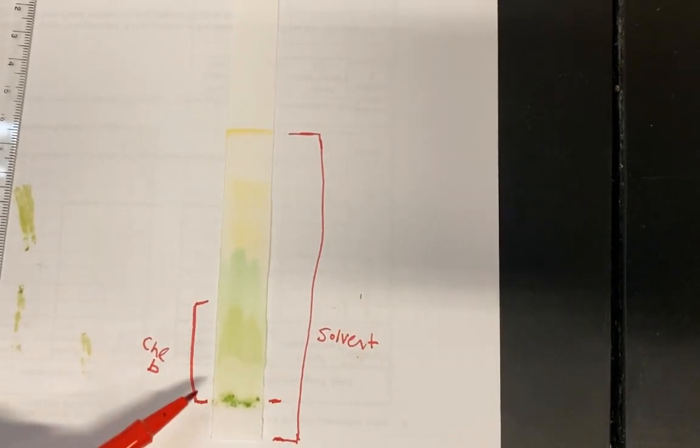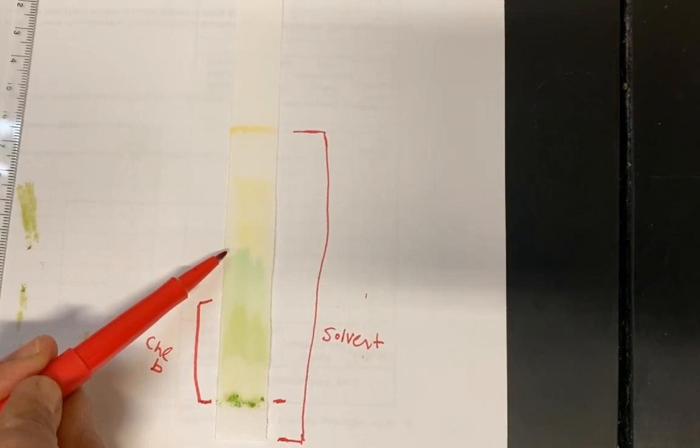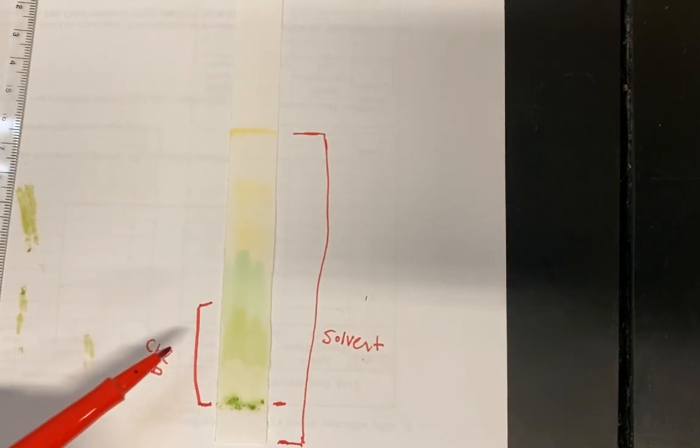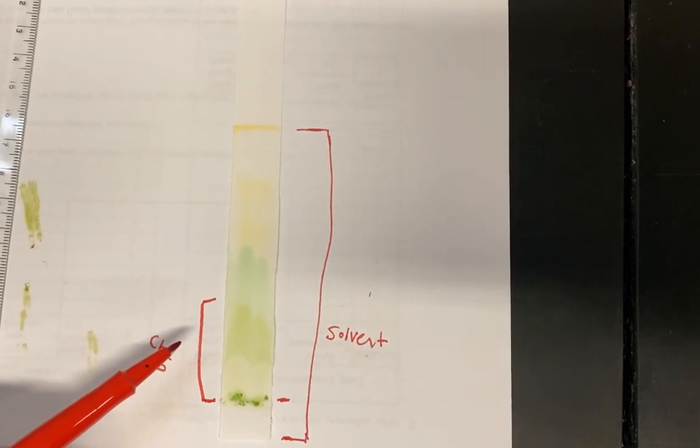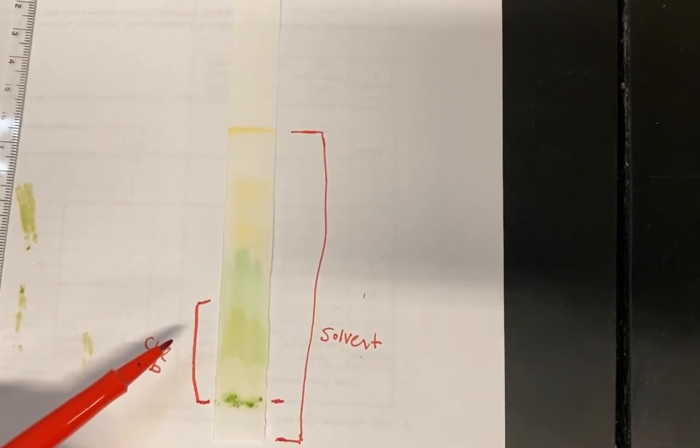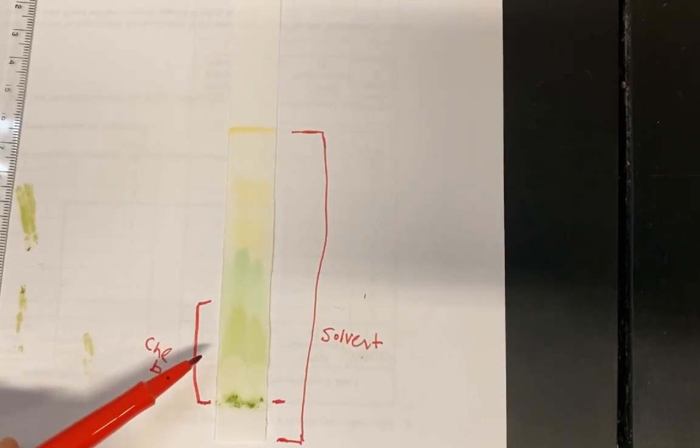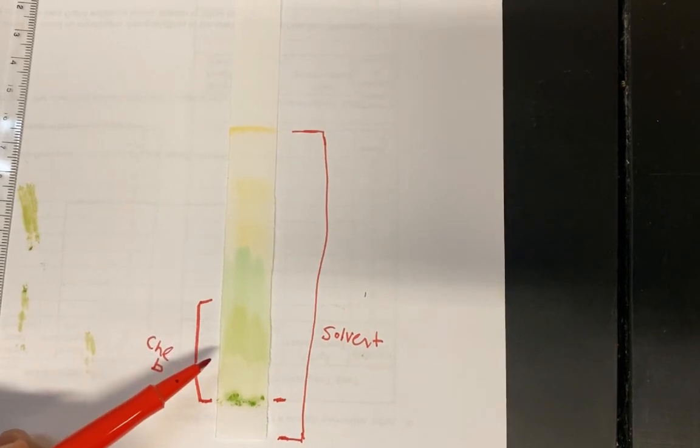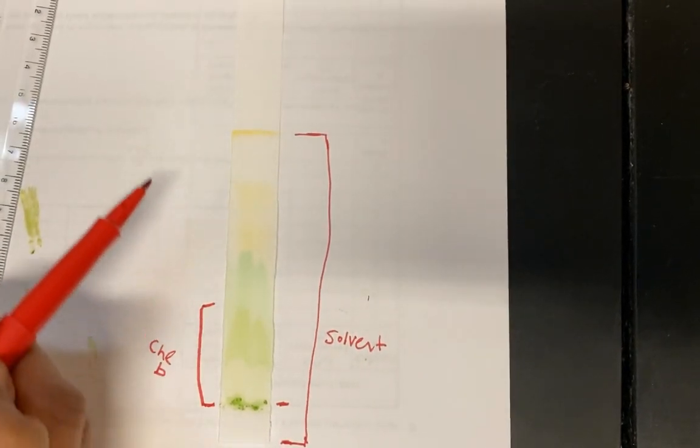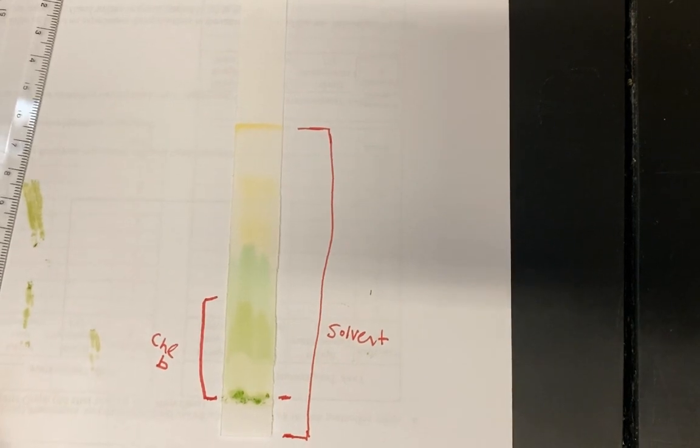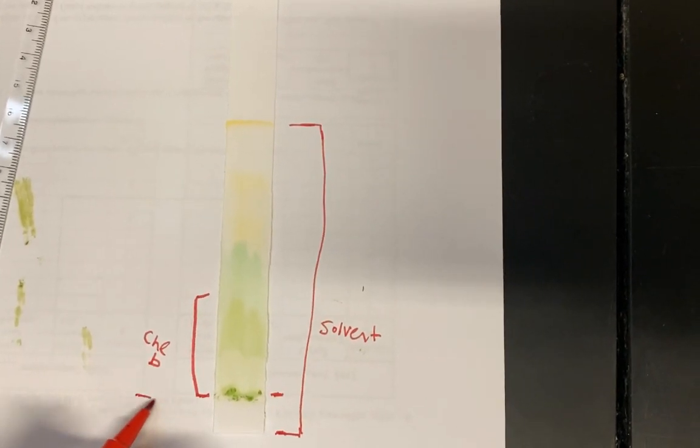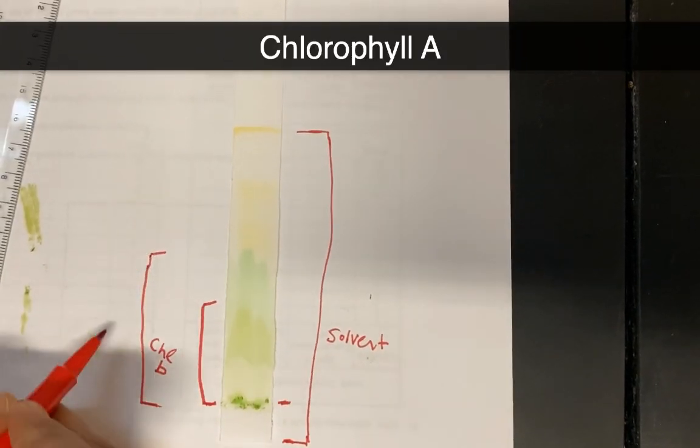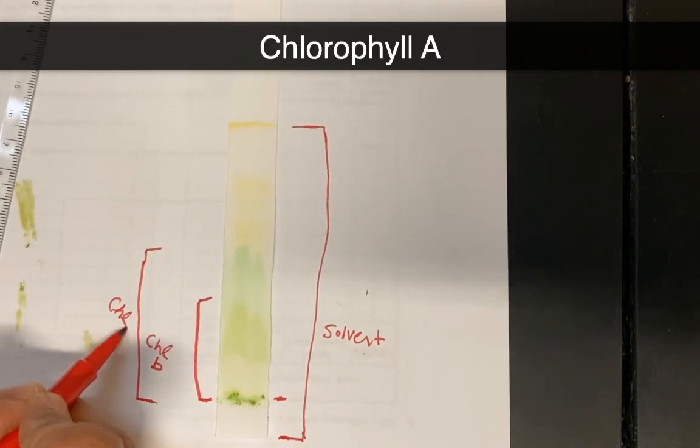And then it looks like chlorophyll A went up a little bit further. So if you remember by reading the lab, the paper is polar. The solvent is nonpolar. So if it's staying lower and sticking to the paper, then the solution, the pigment, like chlorophyll B, is going to be more polar. If it goes up higher, it's being carried by the solvent, and so it's more nonpolar. So my next one starts here, and it looks like it kind of goes to here. So that's chlorophyll A.